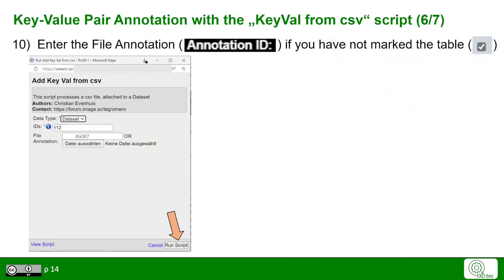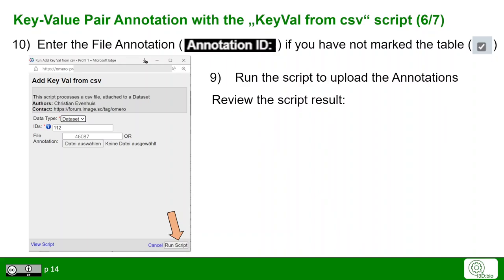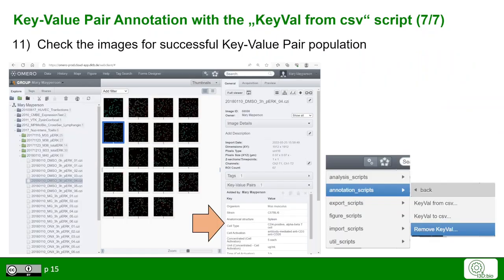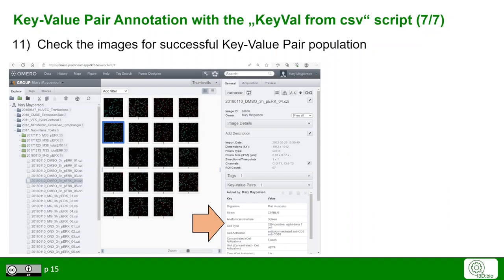Click on the Scripts icon, go to Annotation Scripts, and from there to Key Val from CSV. Once you have chosen the script, the script input window appears. If you marked the CSV table beforehand, it will be automatically filled; otherwise, enter the annotation ID manually. Once finished, click Run Script. OMERO will then show you that the key-value pairs were successfully added, and you can check the individual images in OMERO web to verify.